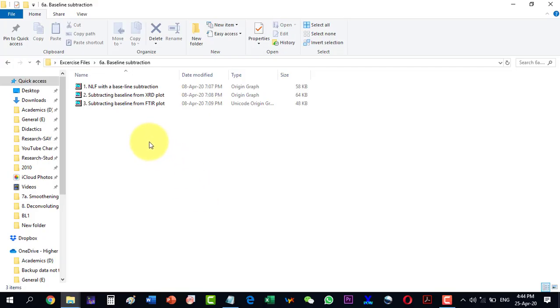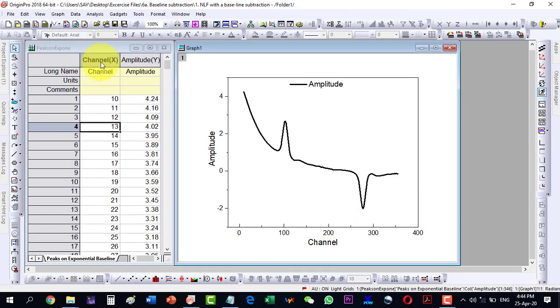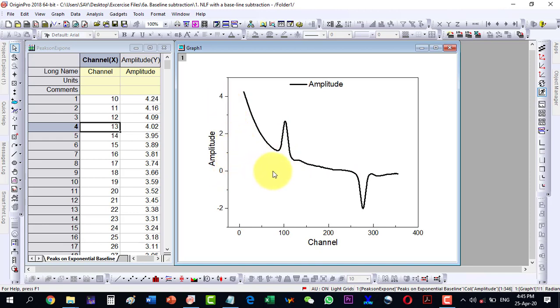In this video we will talk about how to subtract a baseline from a given plot. We have two-column data — X and Y — and the plot shows a decaying function with a peak and an absorption-type feature. This plot clearly has a baseline problem because it is supposed to be flat, then going up, then down.